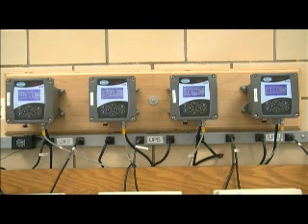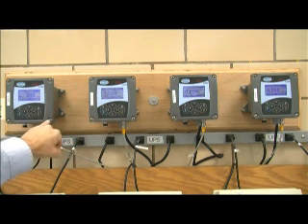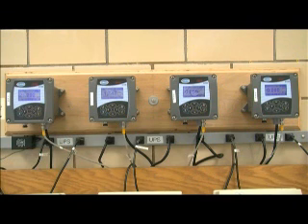As you can see, the raw water turbidity is a little bit just under 21 NTUs. Now, after we add chemicals in the flash mix, coagulants, etc., and let the water settle out, we then measure the turbidity again. We call that the filter influent. As you can see, the turbidity has gone from 21 down to 1.74 NTU, which is a huge drop in a very short period of time.